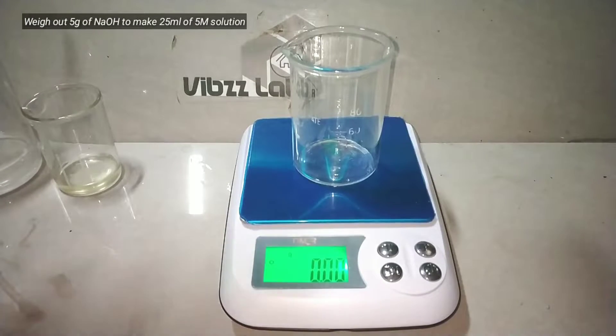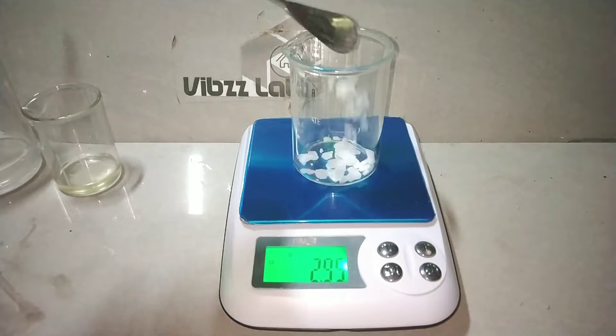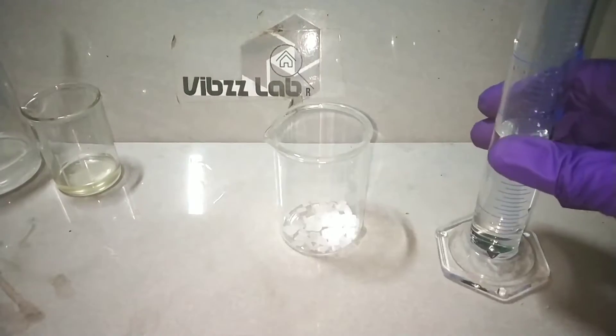Now I weigh out the sodium hydroxide required to make the 5 molar solution. If you want to make 100 ml of it, you need 20 grams of sodium hydroxide. I only need 20 ml of the 5 molar sodium hydroxide here, so I only made about 25 ml of the solution, for which I need 5 grams of sodium hydroxide.